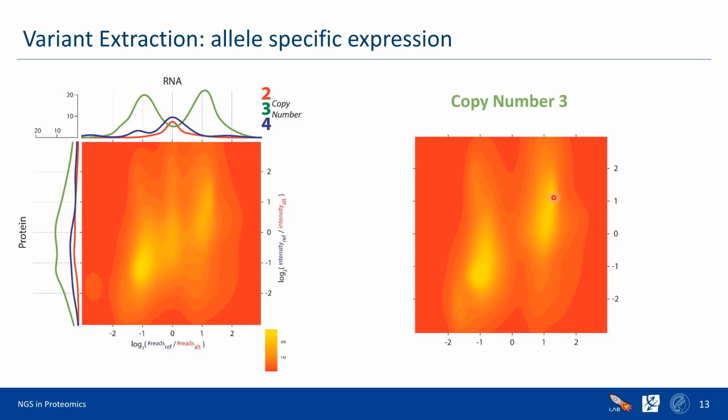But you can also see that on the proteomics level, the standard deviation is nothing comparable to the RNA sequencing level. And we can probably blame the physical chemical properties of the peptides. Maybe mutations or variants are bringing some physical chemical changes to the peptide. But this is something that has to be explored. And honestly, I can predict that some very targeted approaches, for example PRM, could be really useful to do this really precisely concentration-wise, and that's, I think, the future of such studies.